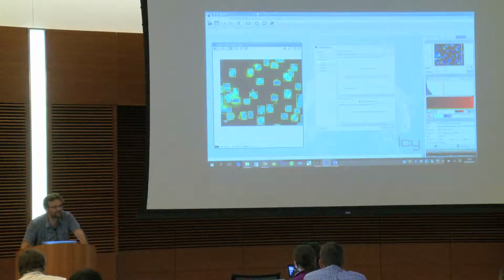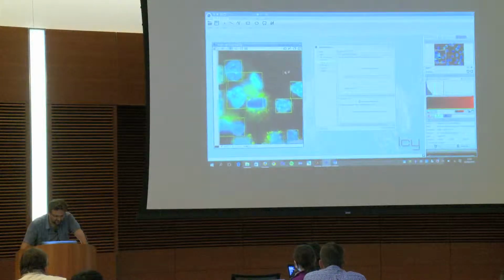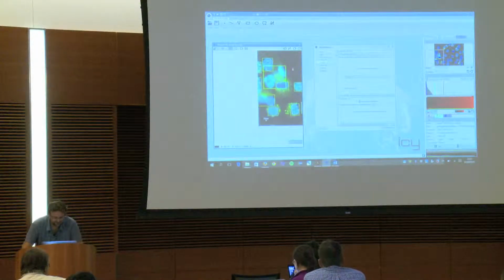And I'm facing exactly the same problem as the one that you had this morning, meaning that this row, for instance, is a mask, okay? So I don't know if you see it well, but only this part is drawn, is considered. This thing is a bounding box, okay? And thanks to the history, I can go back to my original position.